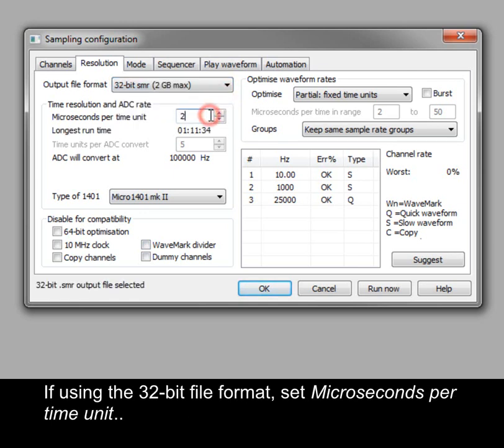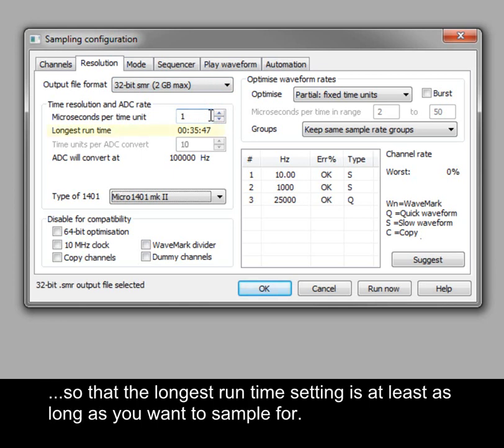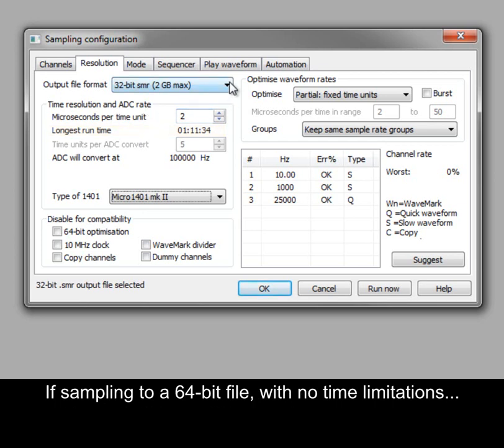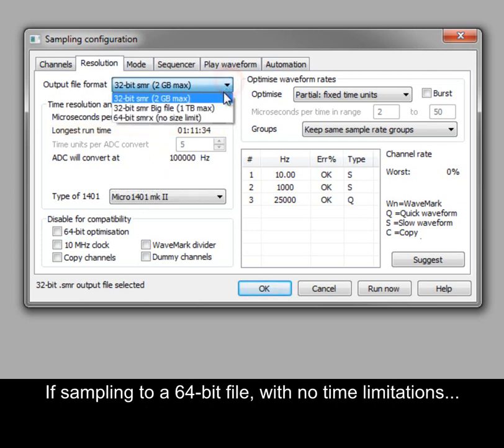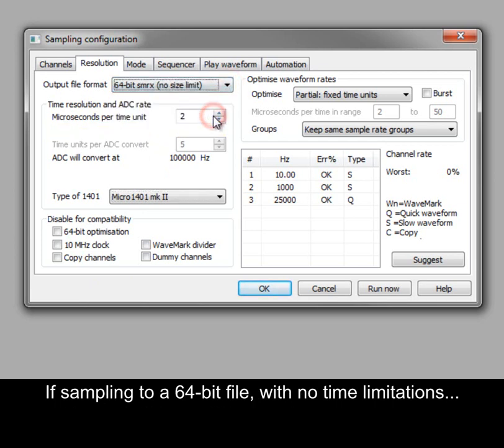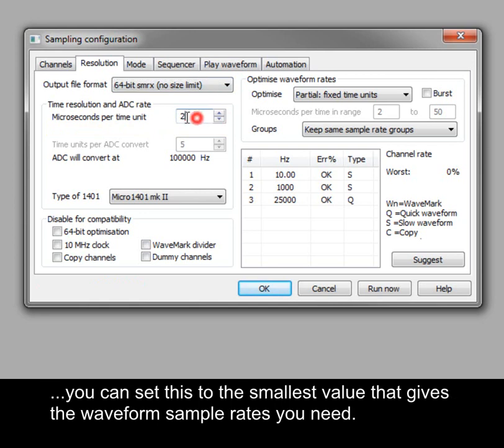If using the 32-bit file format, set microseconds per time unit so that the longest runtime setting is at least as long as you want to sample for. If sampling to a 64-bit file with no time limitations, you can set this to the smallest value that gives the waveform sample rates you need.